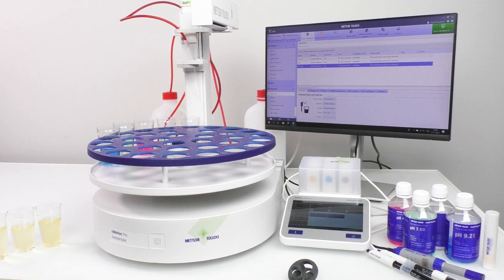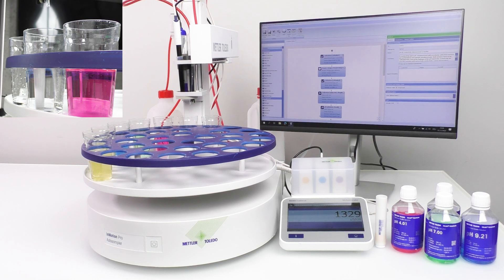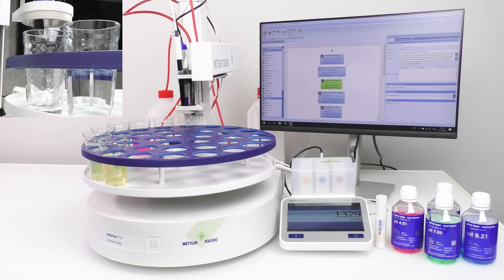Well, Mettler Toledo has a solution for you. Our multi-channel 7 Excellence pH meter and in-motion auto-sampler streamline your analytical processes and improve efficiency.